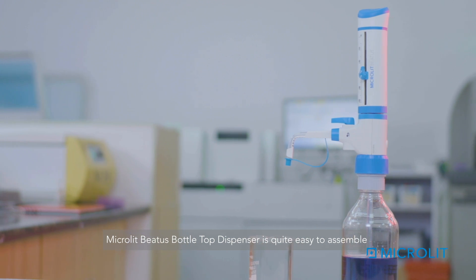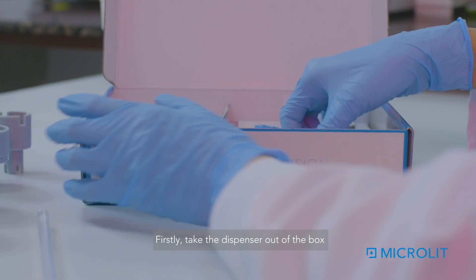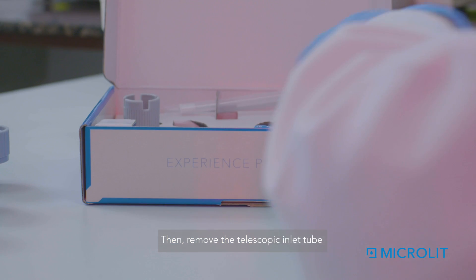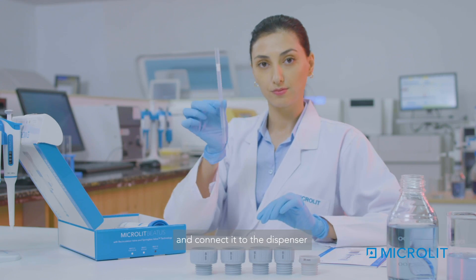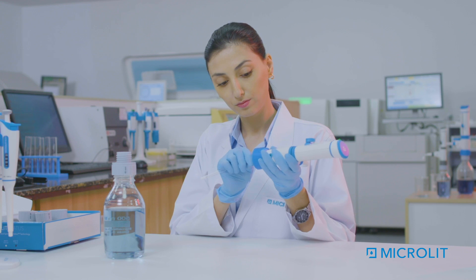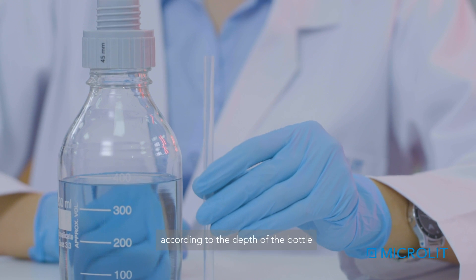Microlit Beatus Bottle Top Dispenser is quite easy to assemble. Firstly, take the dispenser out of the box. Then, remove the telescopic inlet tube and connect it to the dispenser. Adjust the length of the telescopic inlet tube according to the depth of the bottle.